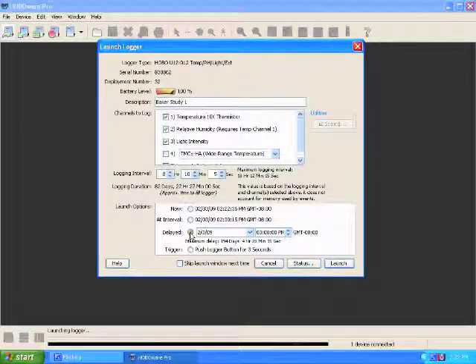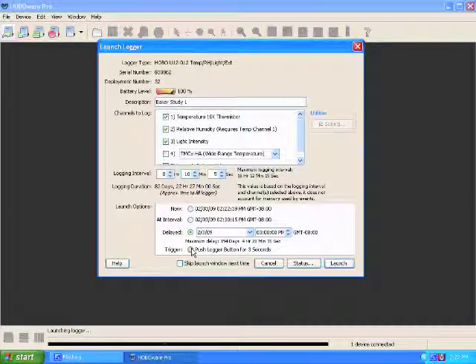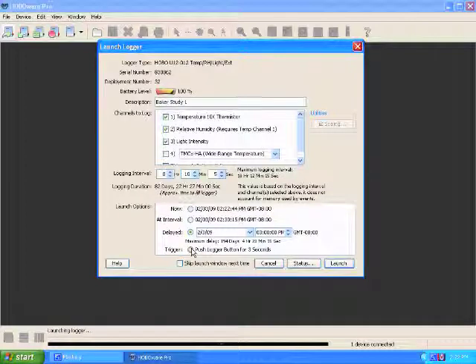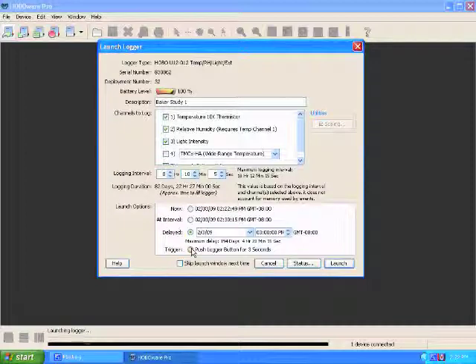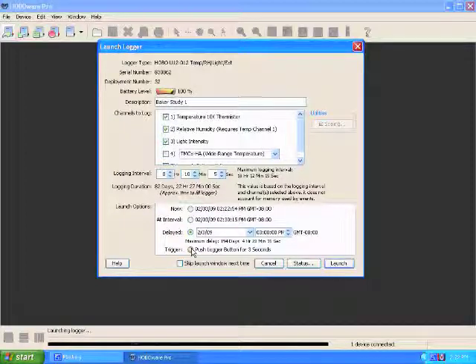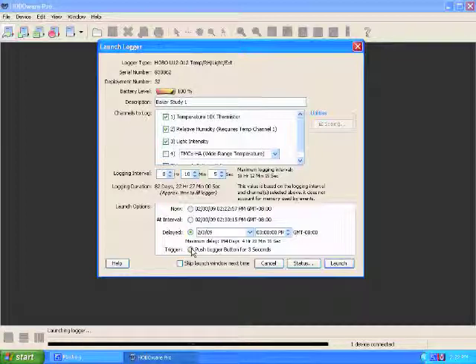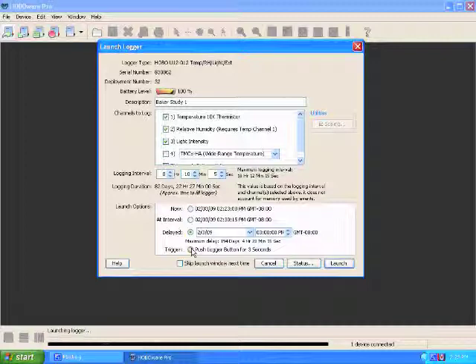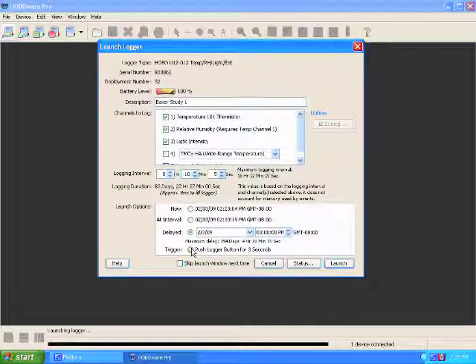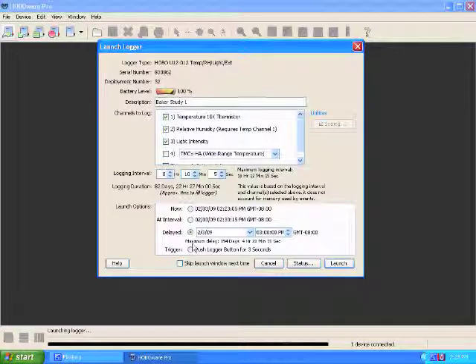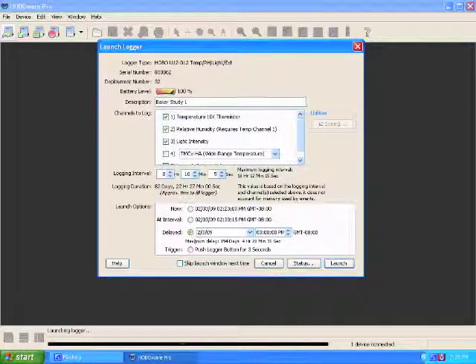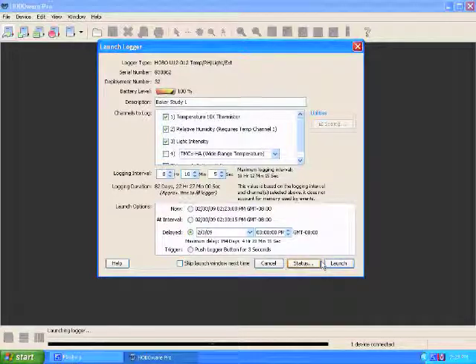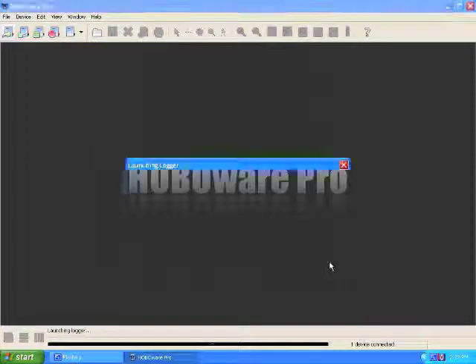One last option you have is on the U12s, there's a small black button on the front underneath the light. And you can push that and it will automatically start logging from whenever you hit that button. You can try launching multiple ones by pushing that button and trying to get them to line up. You might get them close, but it's probably better to use the delayed start if you're using more than one. So I'm going to click the launch button. And you're ready to go.